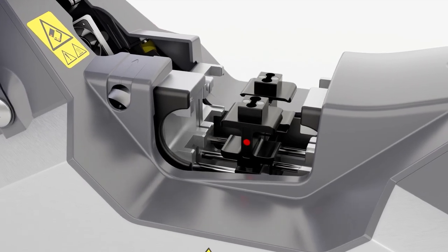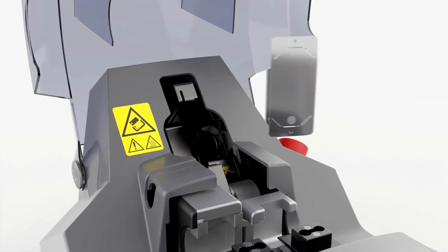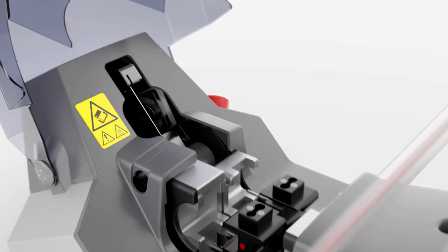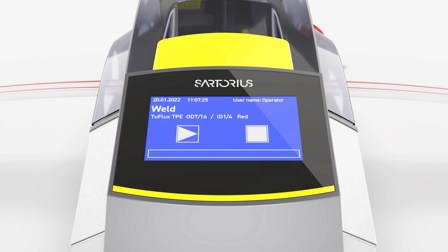Insert the tube holders first. After that, position the cutting blade and the TPE tubes, and then close the lid. Press Start to initiate the welding process.